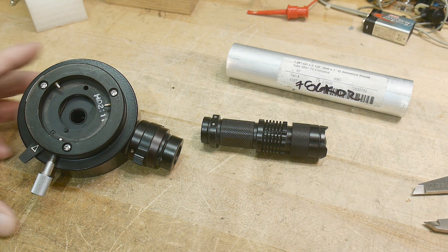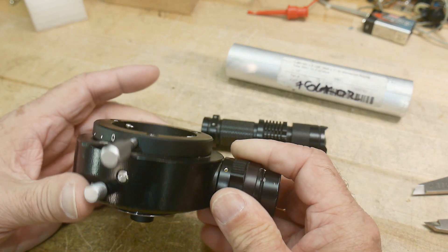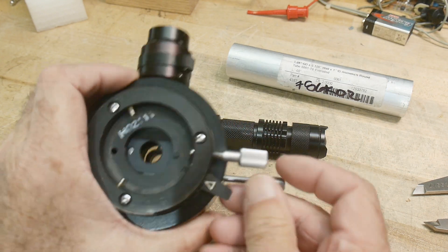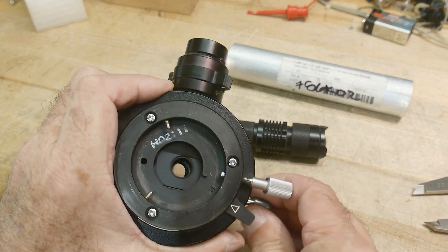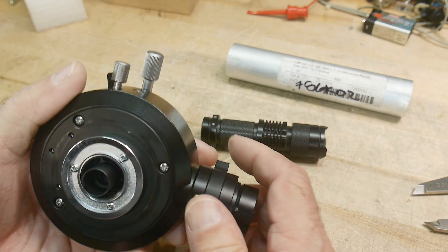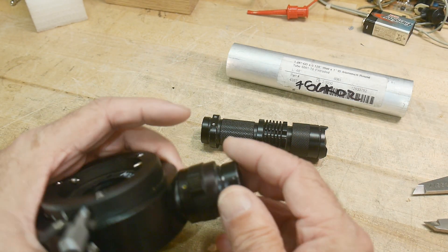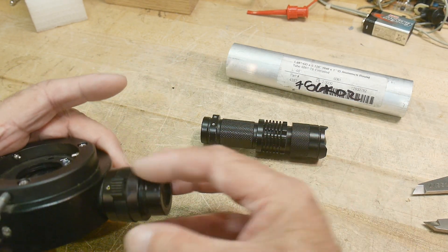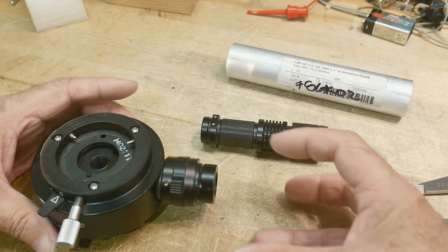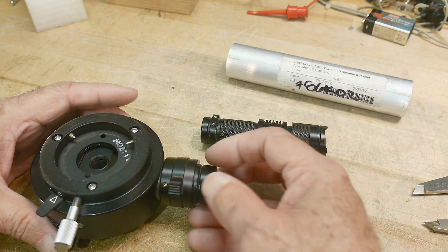I get to do some machine shop stuff today. I have this out of my new microscope — this is the illuminator section that has the prisms in it. This moves the prisms in and out for light field and dark field. The light comes in here, and then you look through it that way. So it needs to have an illuminator on this side. From Olympus, it had a big light bulb and heat sinks that came in and attached.